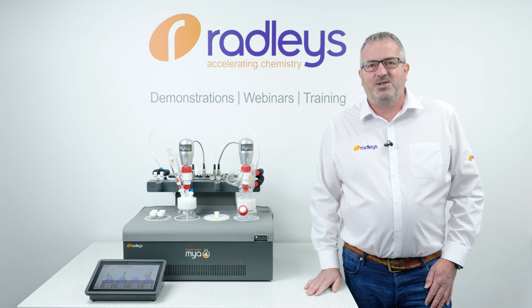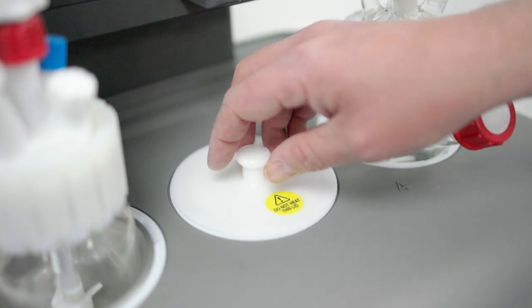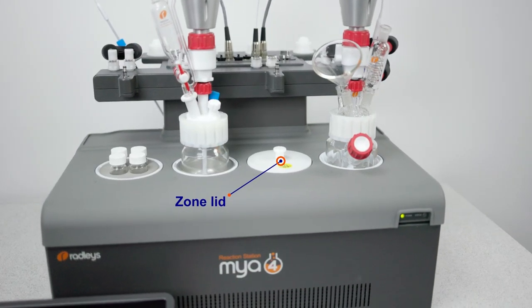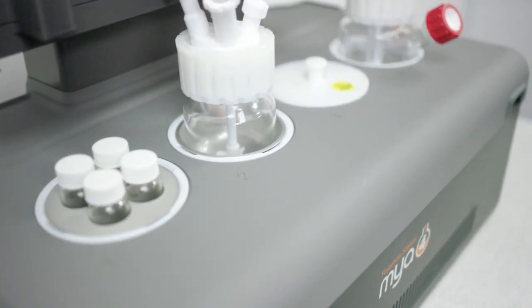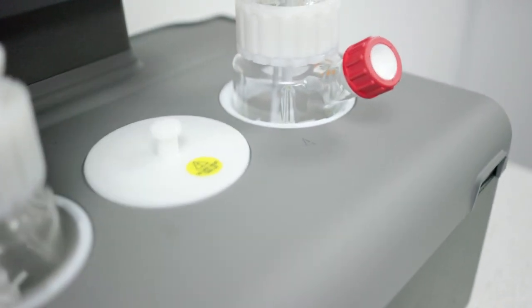Our next new accessory is the zone lid. The simple zone lid will isolate an unused zone, stopping any spills of solid or liquids into the zone well when using an adjacent position. It will also minimize any effect of passive cooling on the zone from the internal cooling.